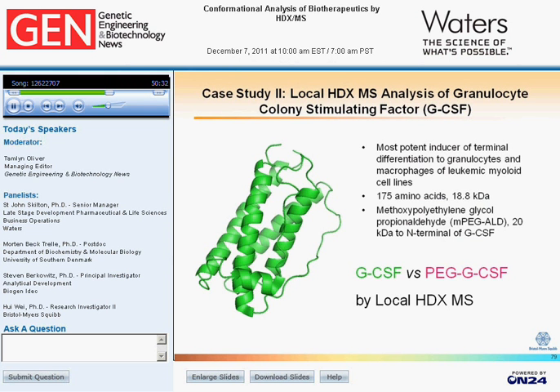Because many final protein therapeutics are pegylated for better stability and drug delivery. There have been changes in protein structure observed for many pegylated proteins. It is challenging to study pegylated protein at the intact level due to the heterogeneity of the PEG for many techniques. So it will be interesting to use peptide-level HDX-MS to reveal more detailed structural differences between non-pegylated and pegylated protein. Next slide.